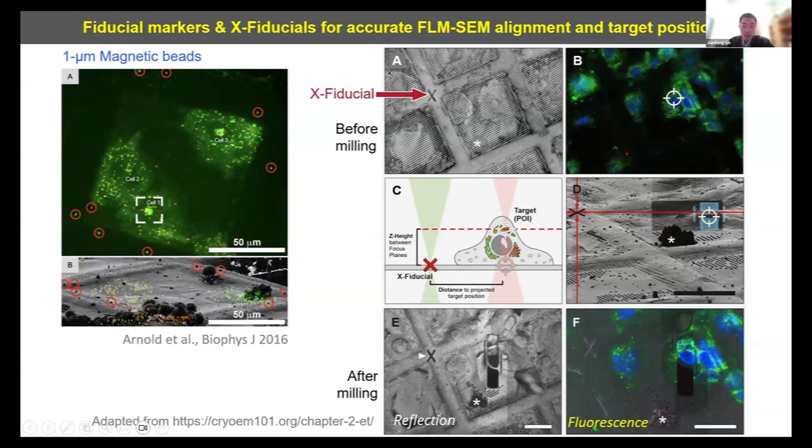The advantage of this system is that it not only provides the image in XY, but also allows you to acquire a stack of images. So from the stack, you get some information in Z, which helps you, based on the guidance of the fiducial marker, to localize the region of the FIB milling locations. I will introduce the example later in the following slides.